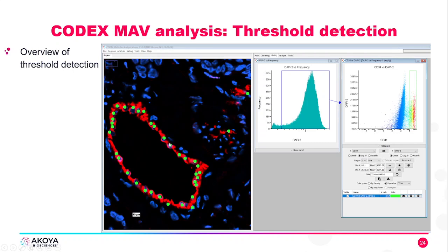How were these green dots formed? First we came into the DAPI versus frequency plot and recognized cells that have positive DAPI. Then we came into the CD34 child plot and selected the cells that had high expression of CD34. The red and green are different colors than the blue because they have high expression of CD34, showing the dynamic range color scaling of CD34 expression. I've selected the upper range of expression—this is a typical gating workflow inside of Codex MAV.